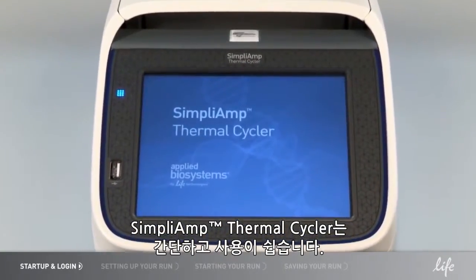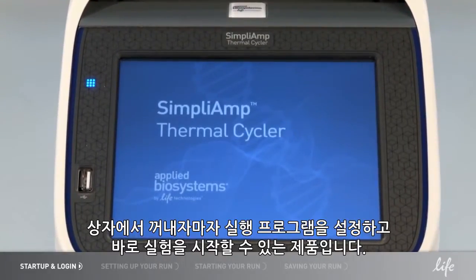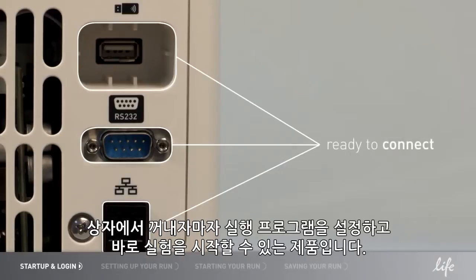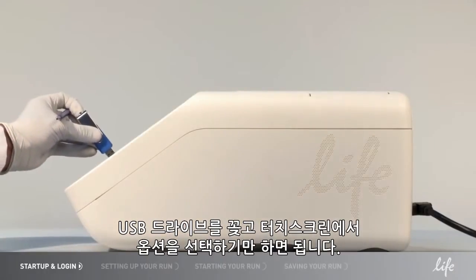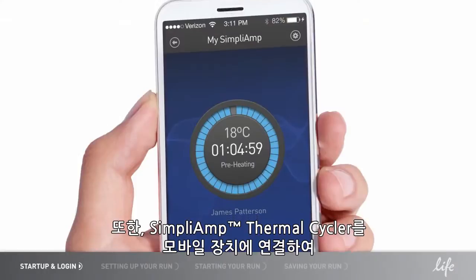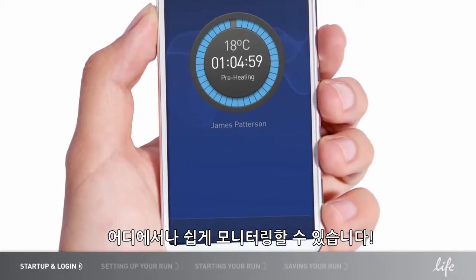The Simply Amp Thermal Cycler is simple and easy to use. It's designed so that you can set up a run, program, and start your experiment right out of the box. You can store, save, and run your program with your USB drive. Just plug in the USB drive and select your options from the touch screen. In addition, the Simply Amp Thermal Cycler can connect to your mobile devices for easy monitoring — anywhere.